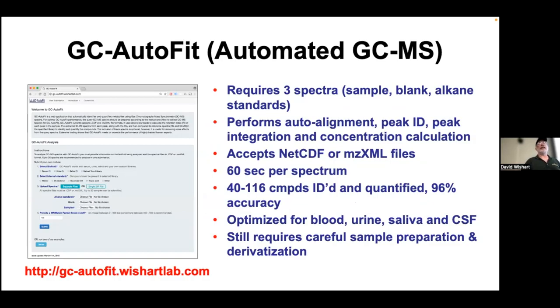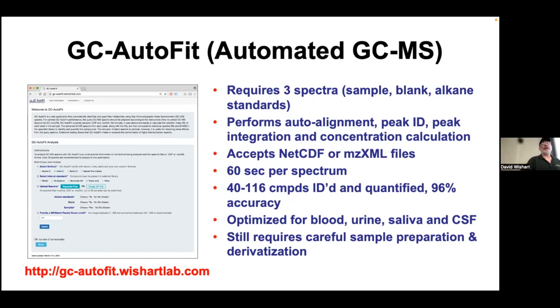GC AutoFit needs three spectra sets: sample, blank, and alkane standards, which can all be zipped together and the program will figure out which is which. There are also example runs to get acquainted. For the lab, you'll be running real samples collected for this course. You should check your alkane standards—there are tools to visualize online, so you can see your spectra. For a urine sample, there are literally hundreds of peaks. You can zoom in and scroll out just like with NMR spectra. It produces a list with HMDB identifiers, compound names, calculated retention index and retention time, intensity, match factor, and concentration.